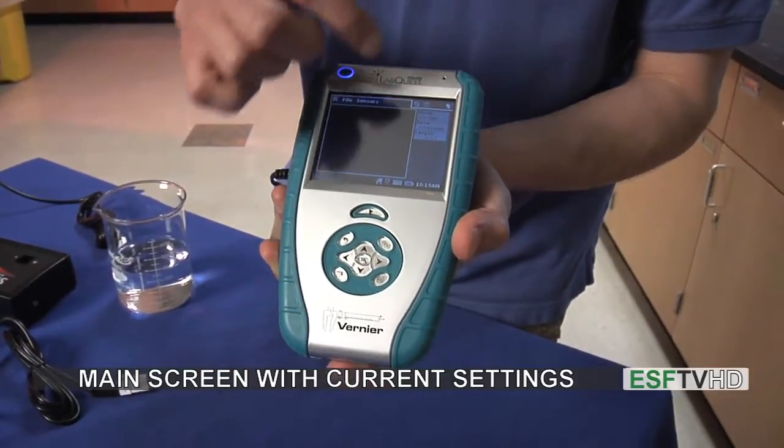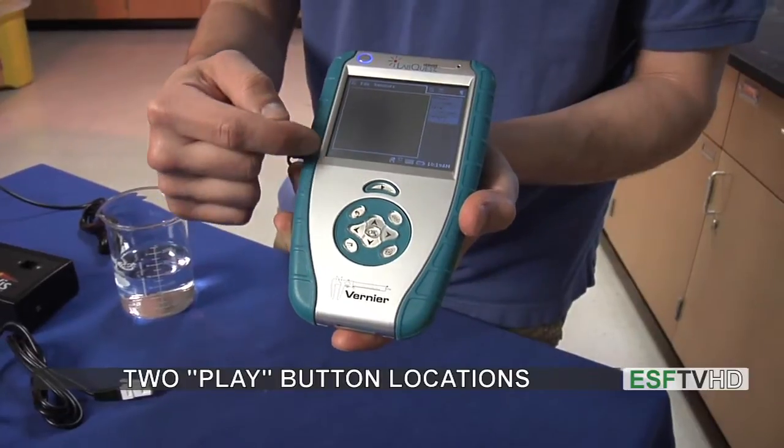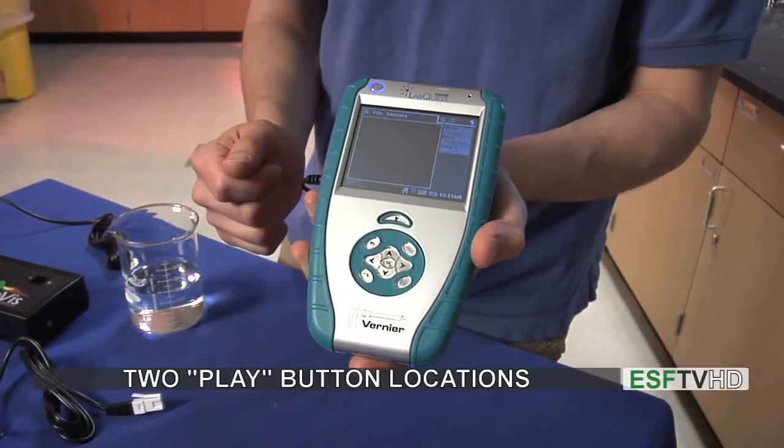We'll have some information about what kind of measurements we're going to take. We also have a play button over here which starts our experiment, and we also have a play button on the device itself which we can touch to look at the experiment.